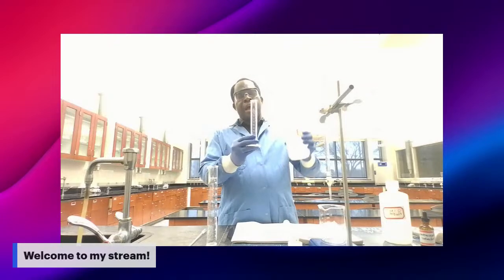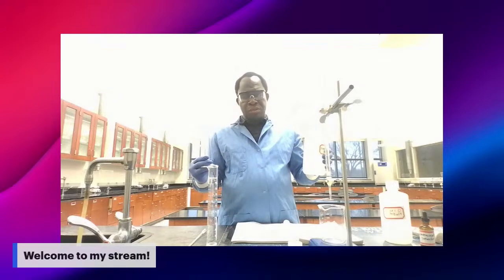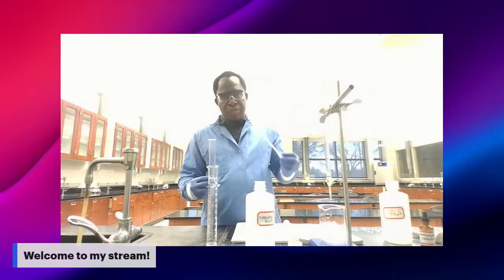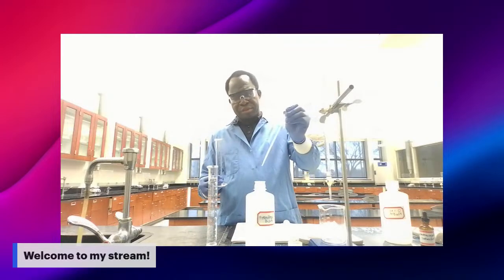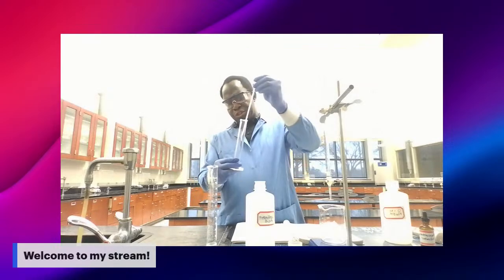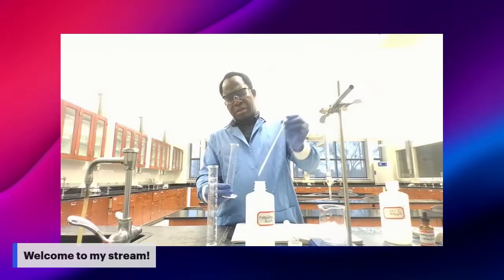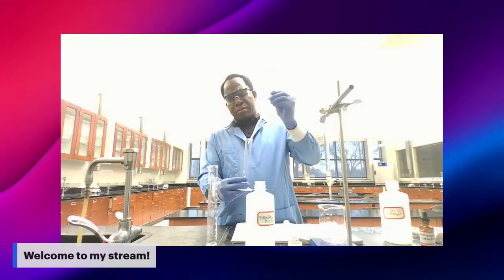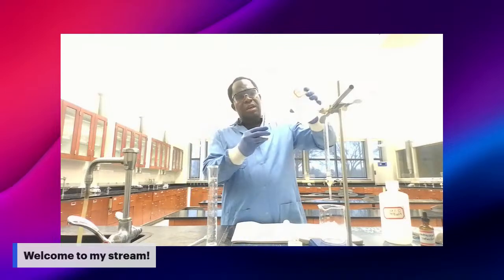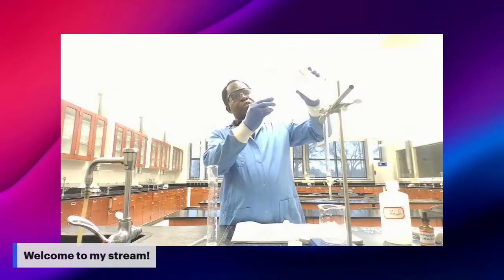Now I can do this because I'm used to measuring those solutions in lab, but if you are not used to it, you can use a pipette to measure the volume. It will take longer, but you have to do it if you are not used to it. Because I'm used to this, I'm going to pour my 25 milliliters.